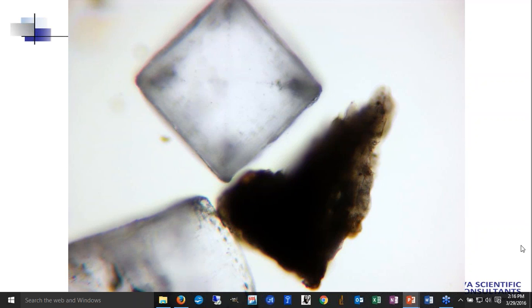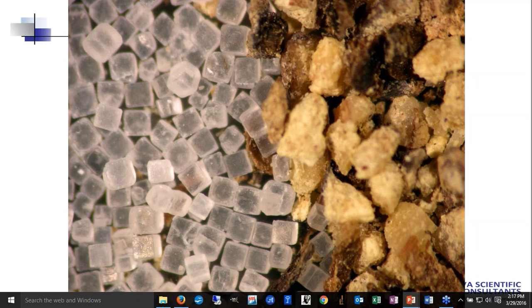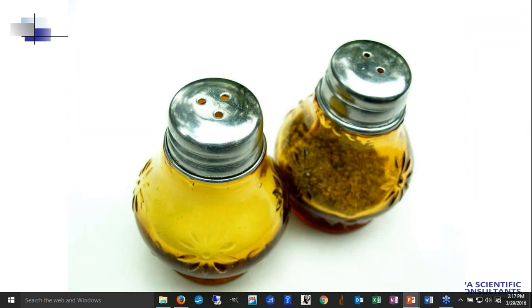If we look at a little lower magnification, back off a little bit, we can see that the square particles are very typical. This is typical of this material. It's very representative, whereas on the right, the darker particles, there's all different colors, all different shades, all different shapes. So it may or may not be typical of the original material. And then finally, to give it away, it's salt and pepper, something that we use and see every day. Point being that the sample needs to be representative. If it's not representative, the analysis you do will tell you something about the particles, but it may not tell you enough about the source or potential sources.